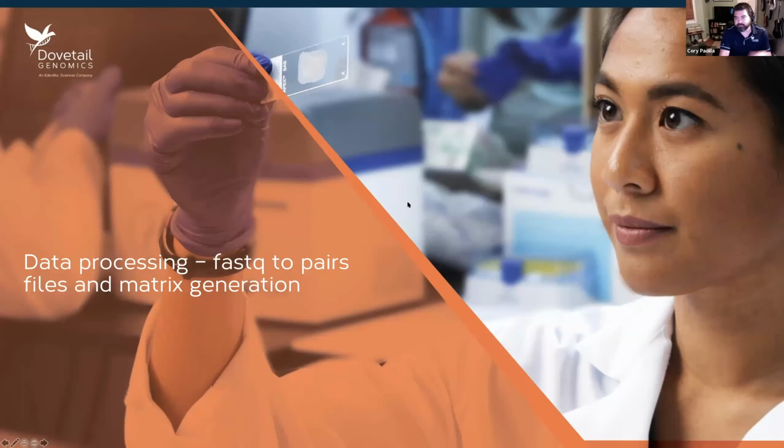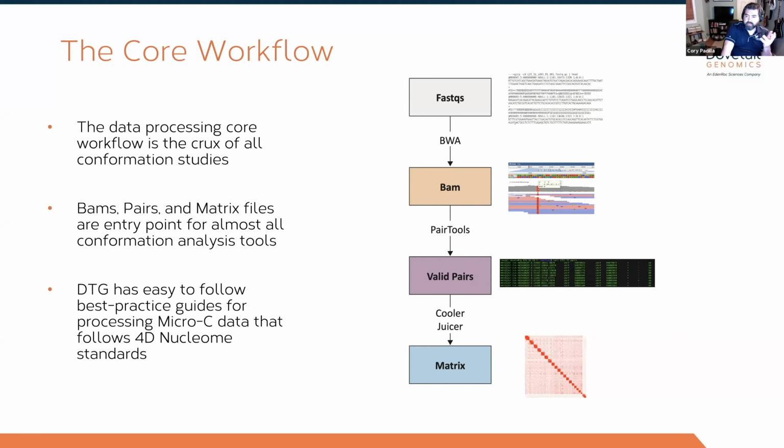All right, so you followed everything that Miriam just said. You now have some libraries and you just got them back off the sequencer and you want to know, how do they look? Are they good? Can you move forward? All of that fun stuff. So I just want to talk about the basic core workflow that all the data are going to have to go through in order to start really asking some biological questions or even asking some QC questions.